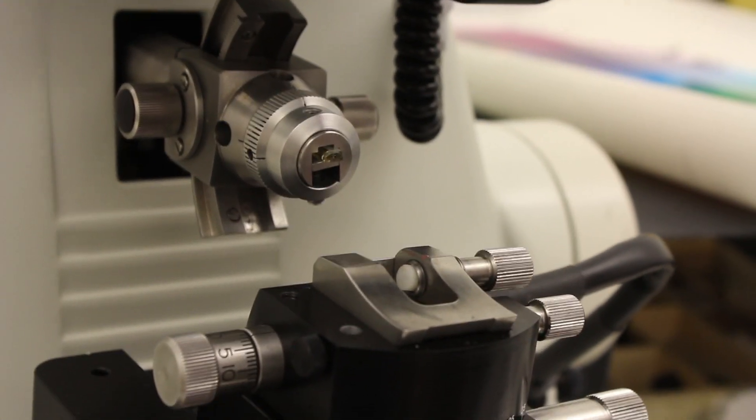And the objective here is to be able to accurately and reproducibly cut sections at approximately 80 nanometers thickness. So is there a blade? Yeah, the blade's not in there. We use a diamond knife.